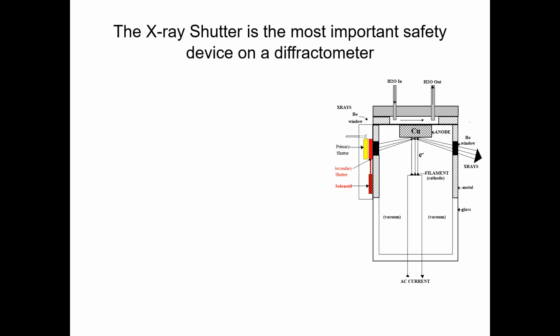Now let's move towards some safety precautions or safety measures while dealing with the X-ray diffractometer. The X-ray shutter is the most important safety device on a diffractometer.